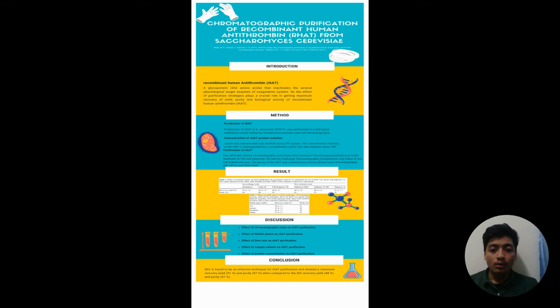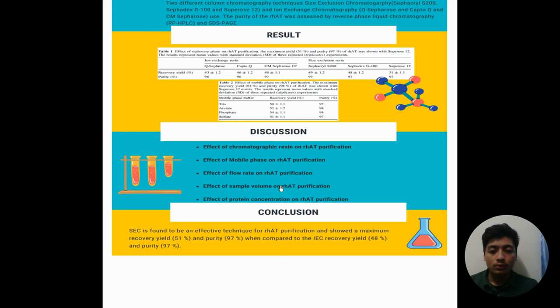Okay, last but not least, we will talk about the conclusion of this journal article. In the conclusion, size exclusion chromatography is found to be an effective technique for rhAT purification compared to IEC, ion exchange chromatography.